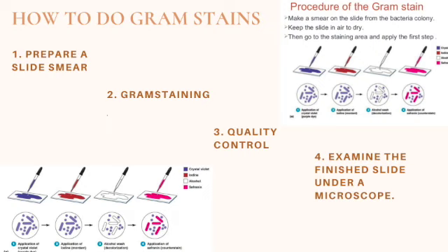Lastly is the application of the safranin, which is the counterstain. So again, you do about 5 drops of safranin O and you let it stand here for 1 minute and you wash it briefly with water and shake off excess. Finally, you examine under microscope at both 400 times power and 1000 times power on oil immersion. That's it.